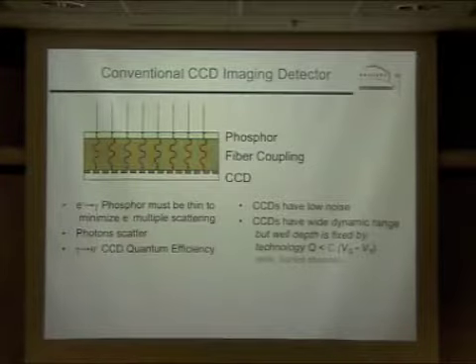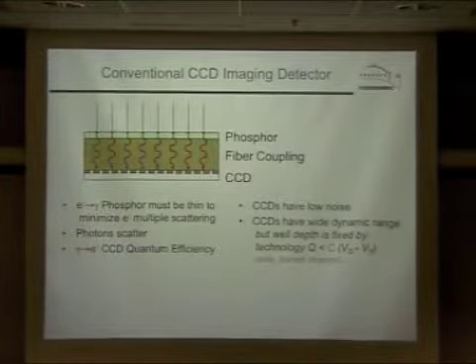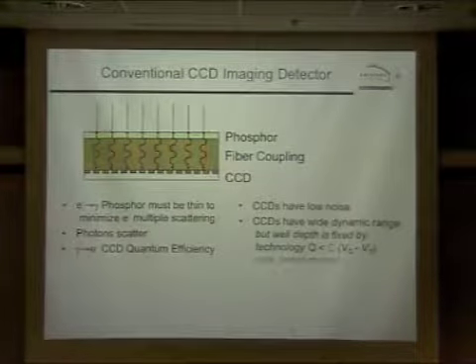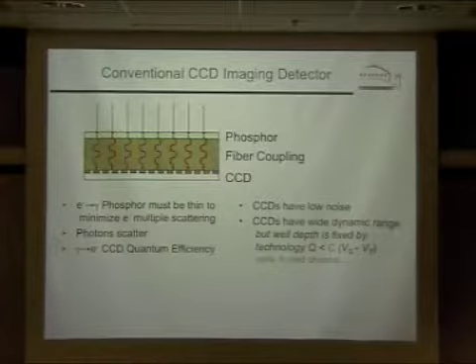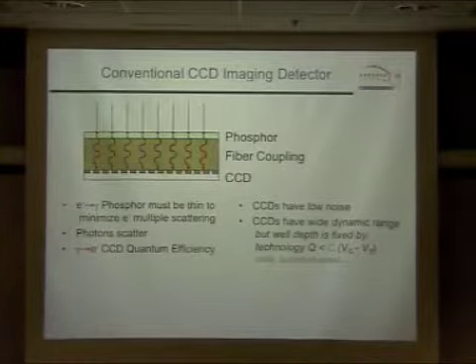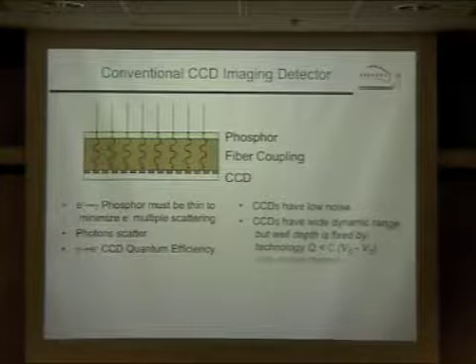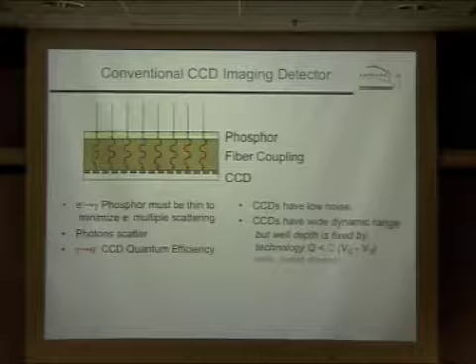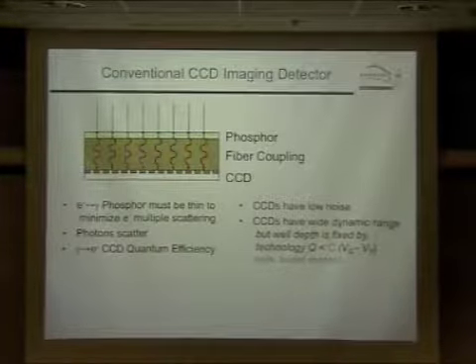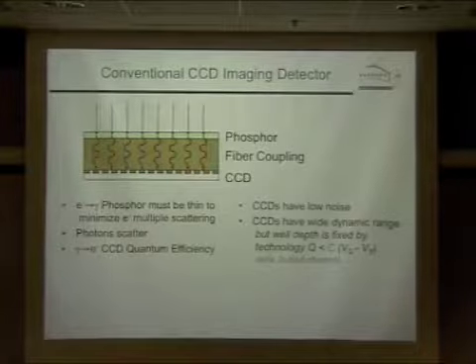It's possible to adjust that some, but it's a factor that does vary from one type of CCD to another. One of the nicest things about CCDs is that they don't have much of a signal corresponding to the fog level of film. They do have a little bit, but it's almost something we can ignore in the context of exposures that we use here.